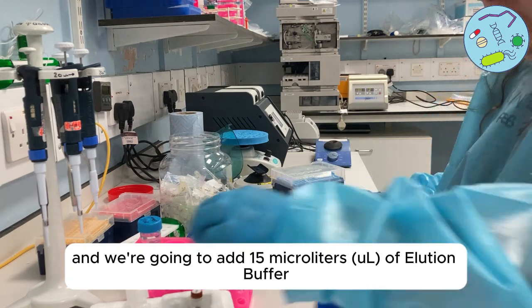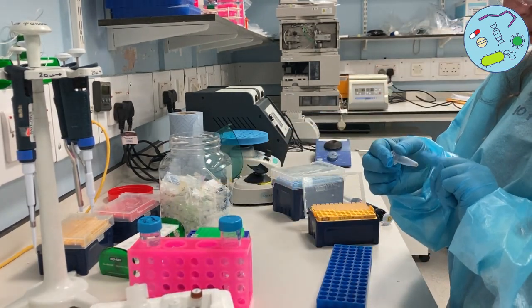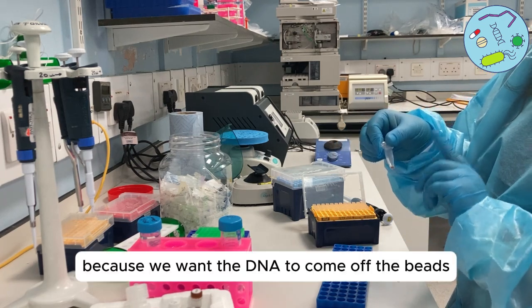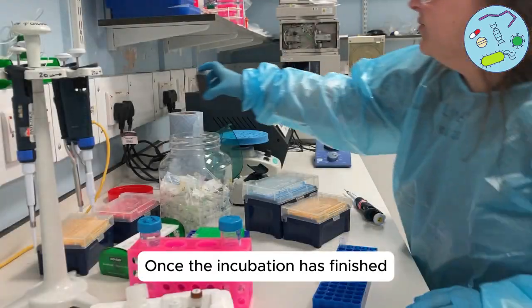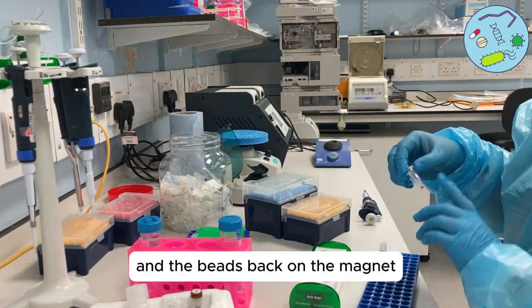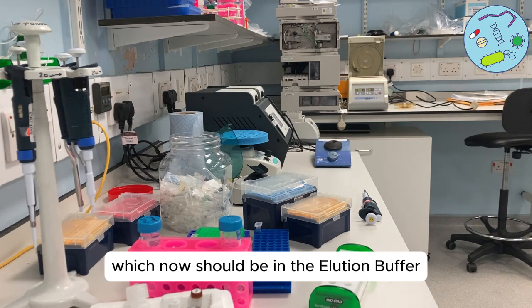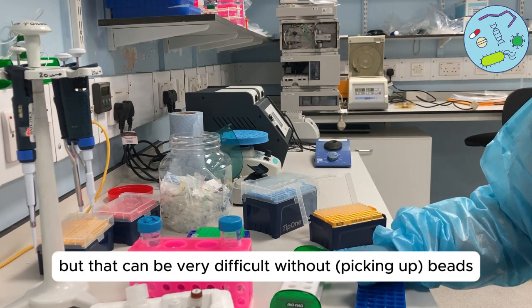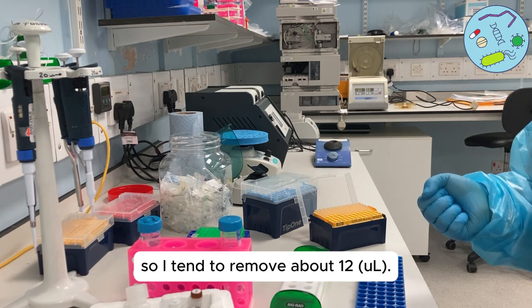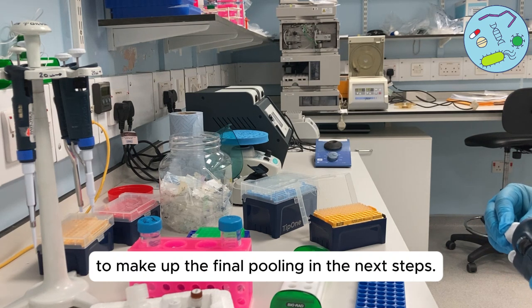We're going to add 15 microliters of elution buffer. Make sure that you've got all of the beads into the elution buffer, because we want the DNA to come off the beads. Spin it down and then leave it for five minutes at room temperature. Once the incubation is finished, put the DNA and beads back on the magnet to separate the beads from the DNA, which should now be in the elution buffer — give it at least one minute. The protocol says remove 15 microliters, but that can be difficult without disturbing the beads, so I tend to remove about 12. You need one microlitre for Qubit and the rest to make up the final pool in the next steps.